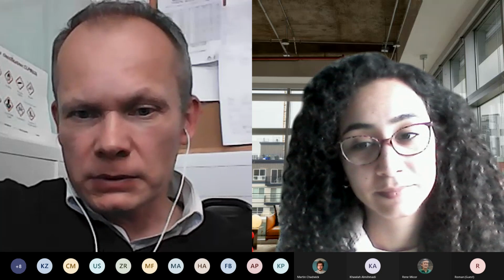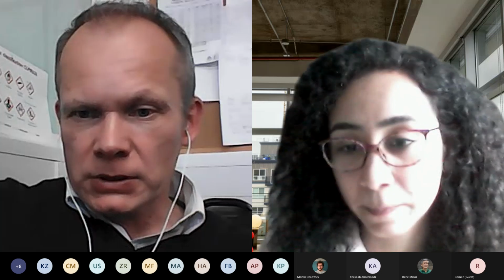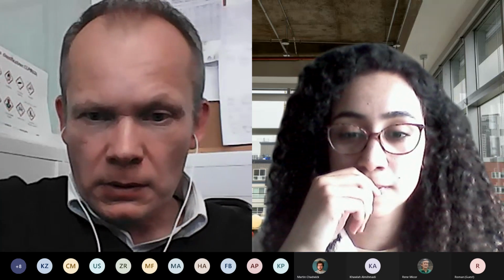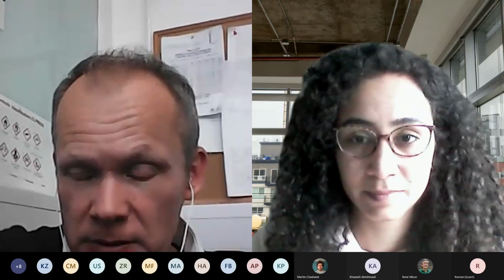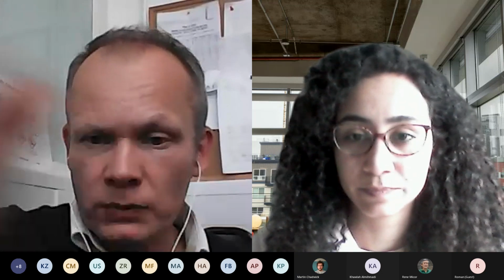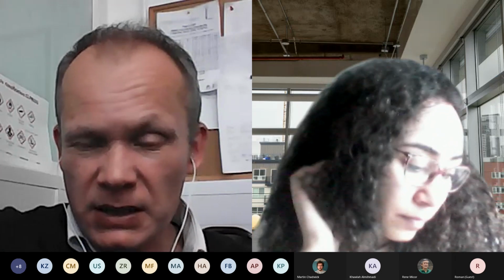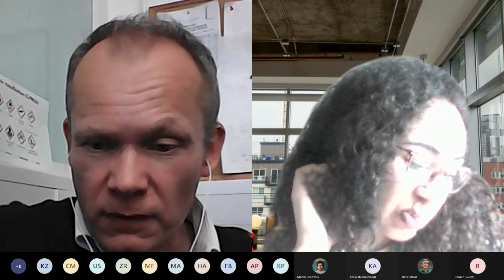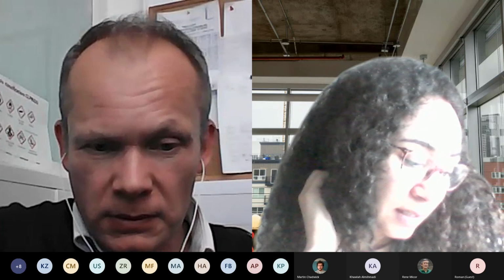Well, I will type my email in the chat. But again, dynamic light scattering works with nanoparticles, from 1 nanometer up to 1 micron. Micro-sized particles are not a good system for DLS. Yes, I see.